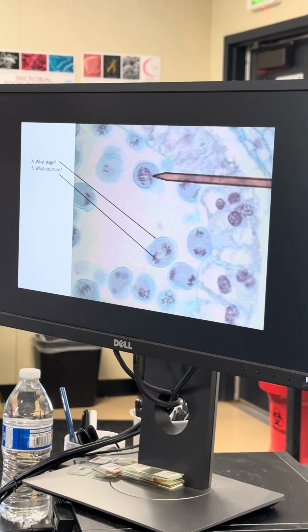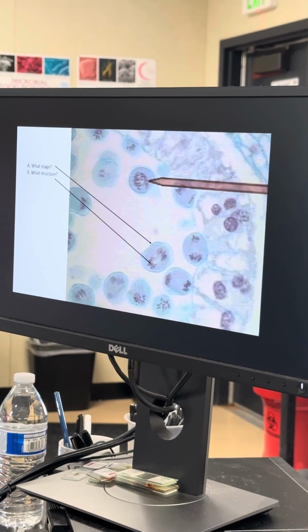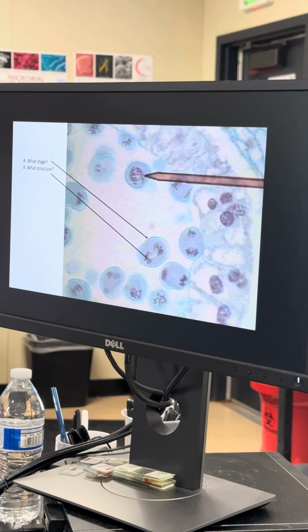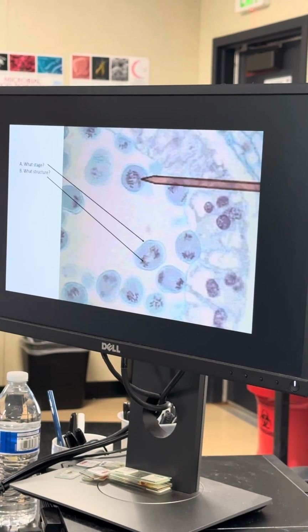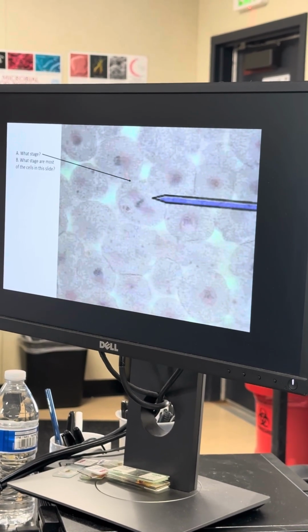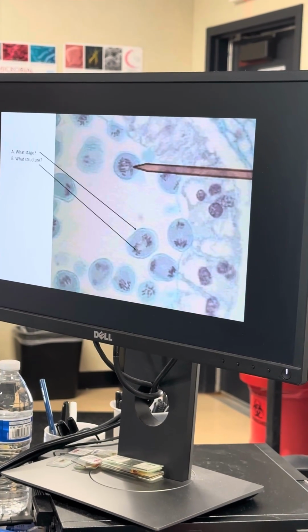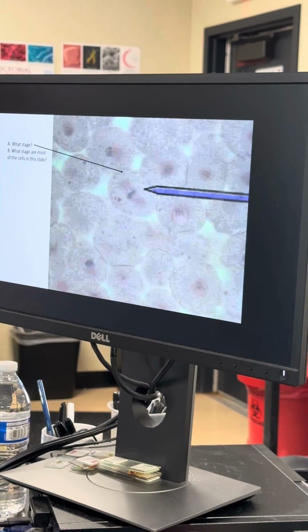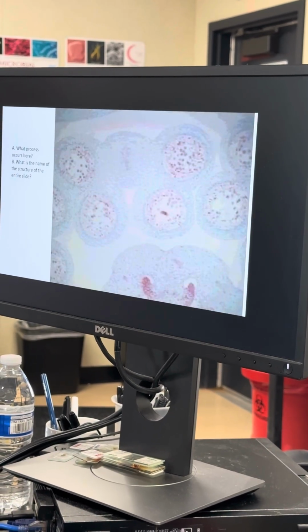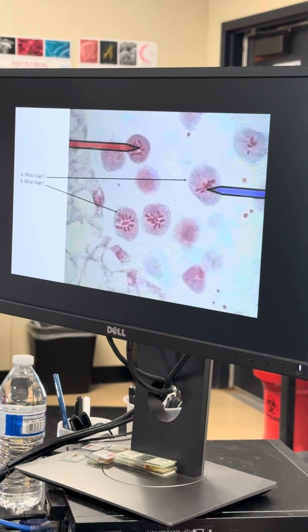You should know, you see how the pollens, future pollens, they are apart from each other. So you should know you are in meiosis. Yes, all of the cells are compact together. Look like these, but no, they're all packed together, so it is mitosis. Of course, this is the meiosis.